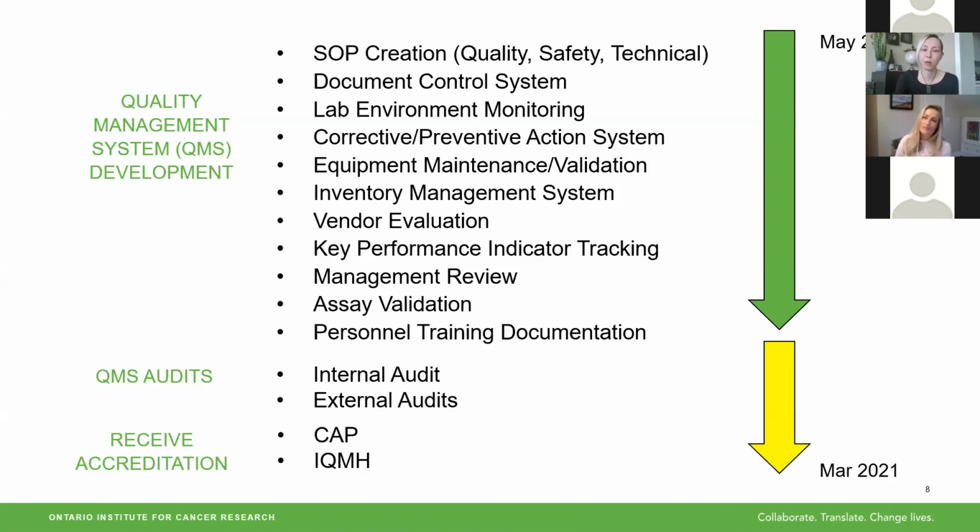We have all of our equipment on maintenance schedule, and there's a lot of documentation that goes along with this. The same goes for our inventory. We built an inventory management system called Ramen to go with our LIMS, MISO. We worked with procurement to set up regular vendor evaluations, because when you lock in assays, you also lock in reagents. So any vendor providing those to you becomes critical.